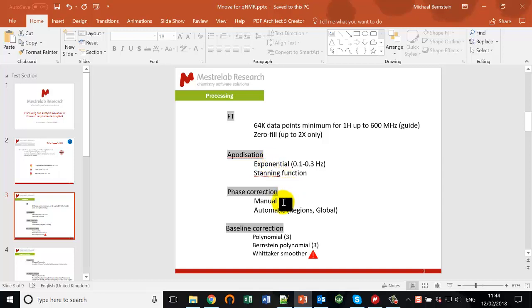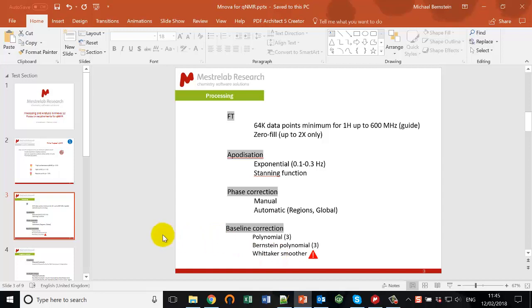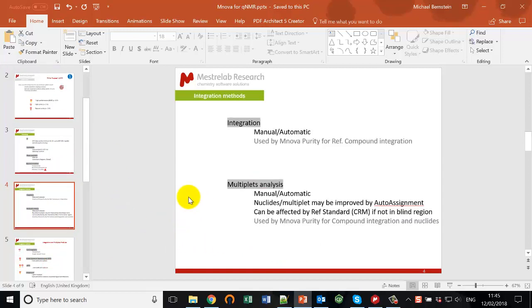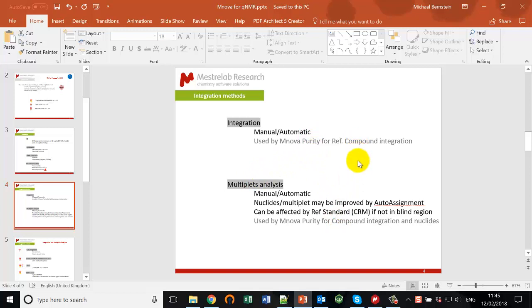Phase correction — you'll all know how to do manual phase correction, but I'll introduce you to what I find to be the best automatic ones available to you. Baseline correction is extremely important and normally for proton we use the first two methods, but I'll also introduce you to the Whittaker smoother which is appropriate in specific cases. For integration methods, we basically have two classes: integration itself, and within multiplet analysis you can perform integration as well, and there's no reason why you can't mix these — which is exactly what we do in the QNMR plugin.